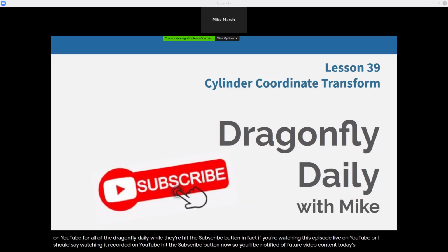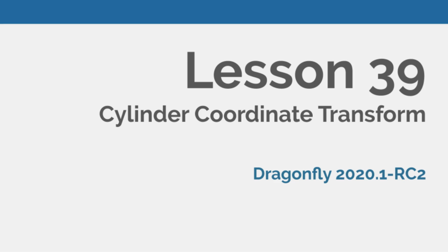Today's lesson, lesson 39, is on cylinder coordinate transforms. We're going to look at data which we normally think of in a rectangular coordinate system, and we're going to talk about cylinder coordinate systems and how you can extract data that way. And we are using Dragonfly 2020.1 Release Candidate 2.